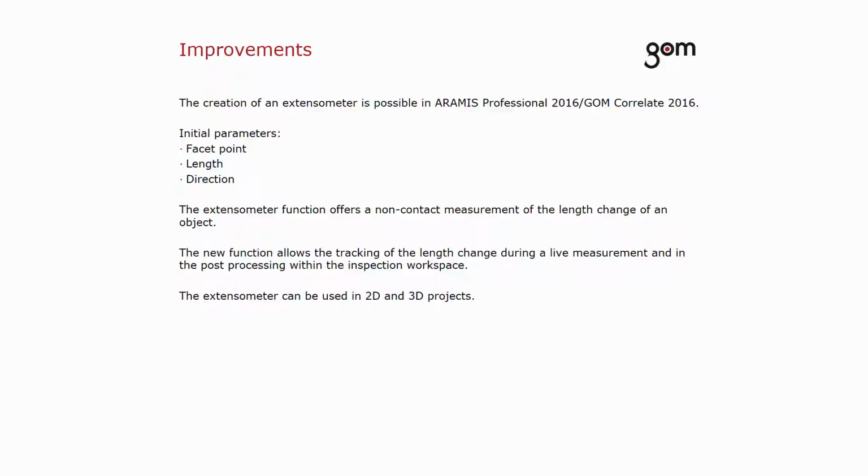The extensometer function allows the tracking of the length change during a live measurement and in the post-processing within the inspection workspace. The new function can be used in 2D and 3D projects.